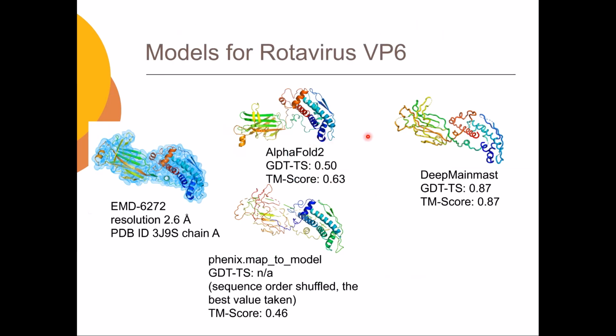This is showing when AlphaFold can be wrong. In this very simple two-domain structure, AlphaFold modeled the individual domains very nicely, but the relative orientation of the domains does not agree with the density, because the protein sequence information at the linker region does not have specific conformation information. But if you trace the density, of course you can identify the orientation correctly. So if you combine both, then you have a better structure.